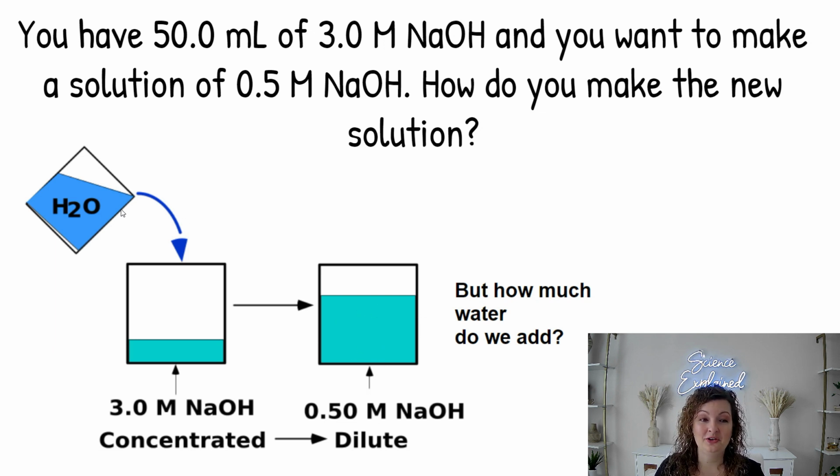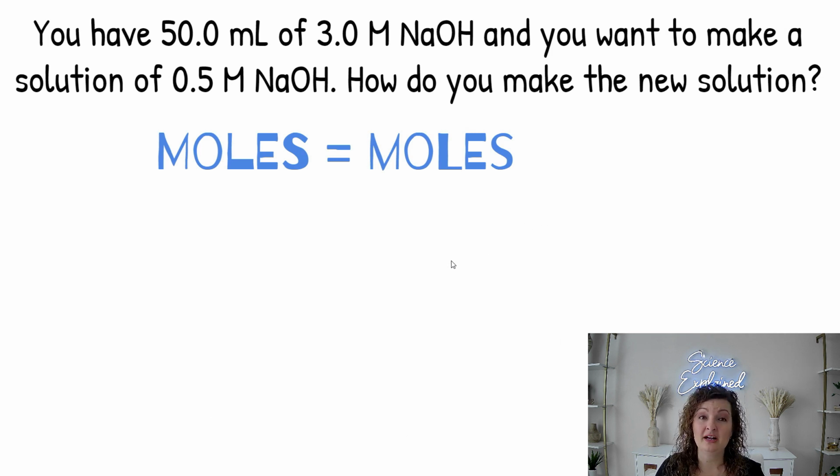We have that increase of volume because we added the water, but how much water do you add, right, in order to get it perfectly at 0.5 molar? So that is the math that you have to do to find it out. And let me show you how we do that. We're going to go back to the concept of moles in equal moles out.